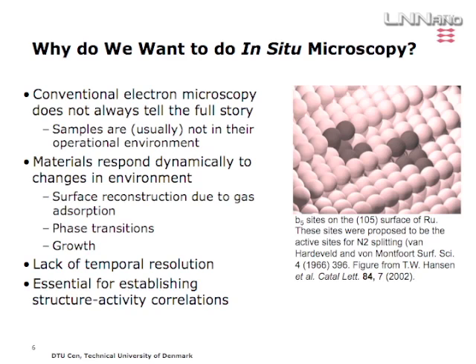They operate in ambient atmosphere or in a catalytic reactor at high pressure. So what we want to do is expose them to an environment that's more typical for the one they're working in, and see how they dynamically respond to changes in this environment.